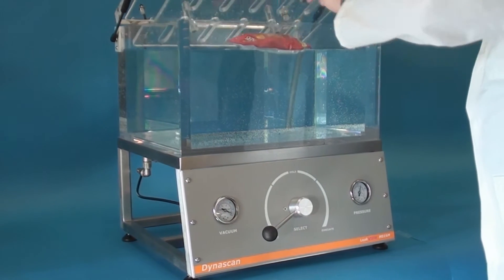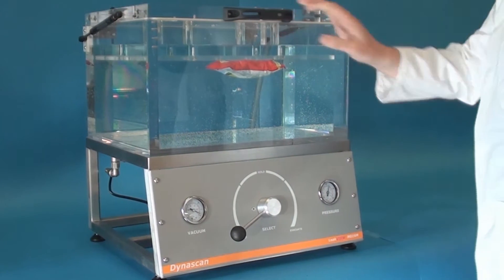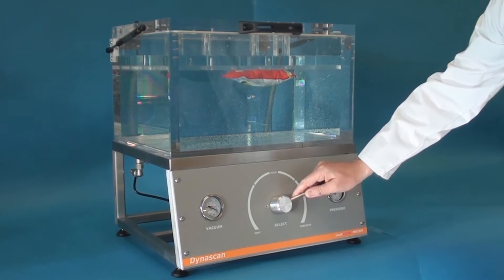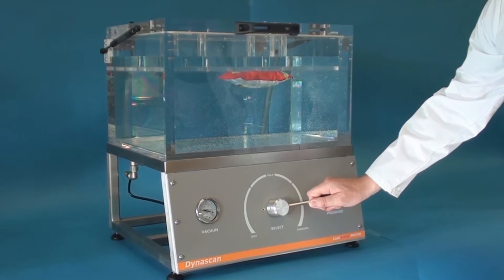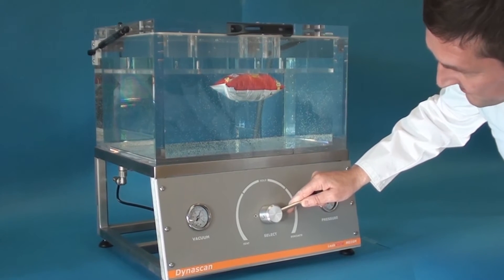To use, load the packaging into this test chamber and close the lid. Then simply rotate the lever to control the vacuum level, which will cause the packaging to inflate. The vacuum level can be held in place with the easy to use interface.